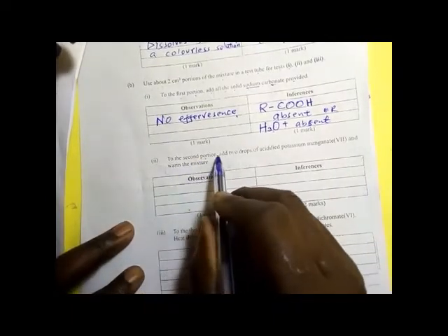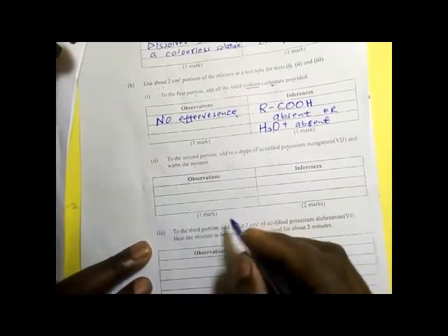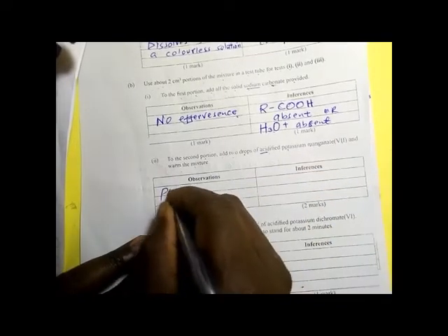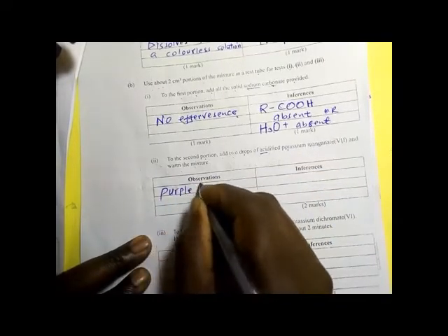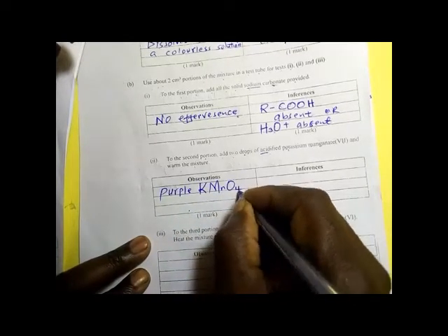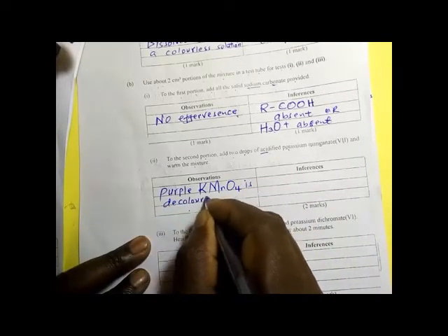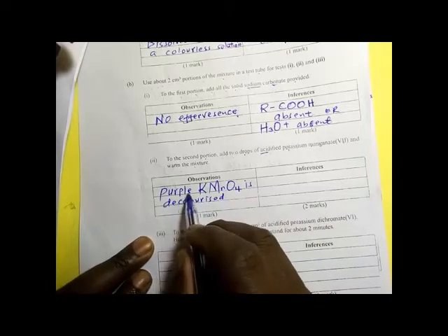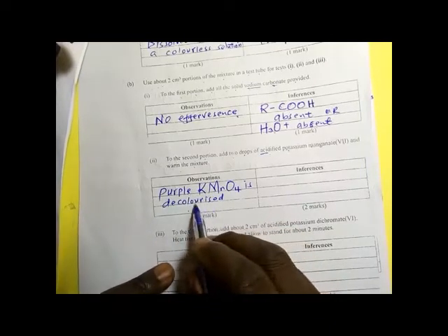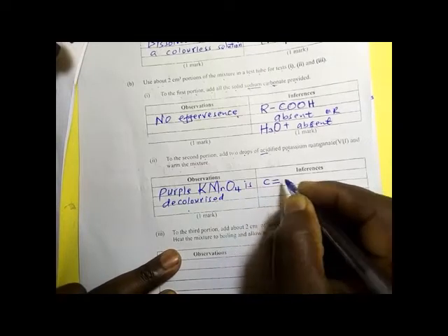To the second portion, add 2 drops of acidified potassium permanganate. Warm the mixture. Remember, acidified potassium permanganate is purple. So the purple acidified potassium permanganate is decolorized, meaning that the purple color changes to colorless. That's what it means. So if that happens, then it means that the organic could have a double bond.